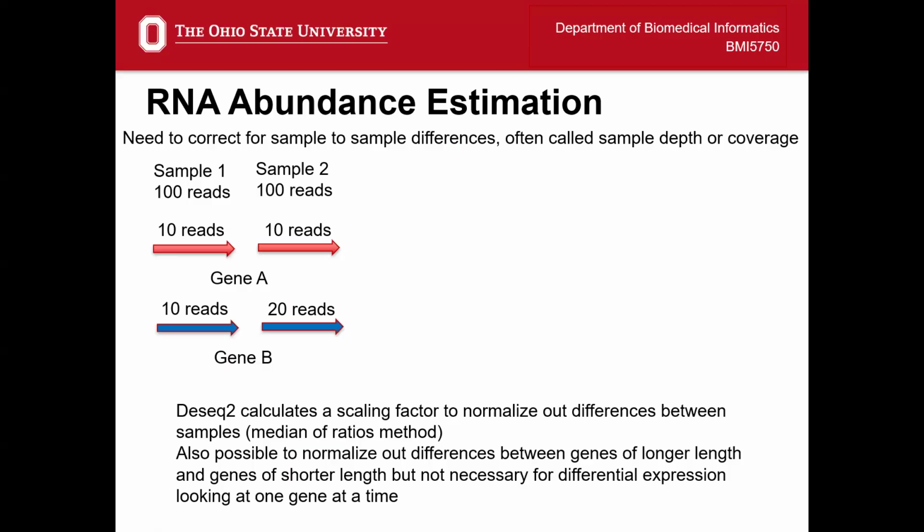Okay, and then our second question is, what method are they using to adjust the p-values? This is going to be a false discovery rate correction. It's the Benjamini-Hochberg method. I don't know if I described in detail how that happens, but the quick basics of it is it sorts the p-values in order and does a calculation for each p-value to make it a little bit larger, depending on what order that p-value is in the list and how many more p-values there are.